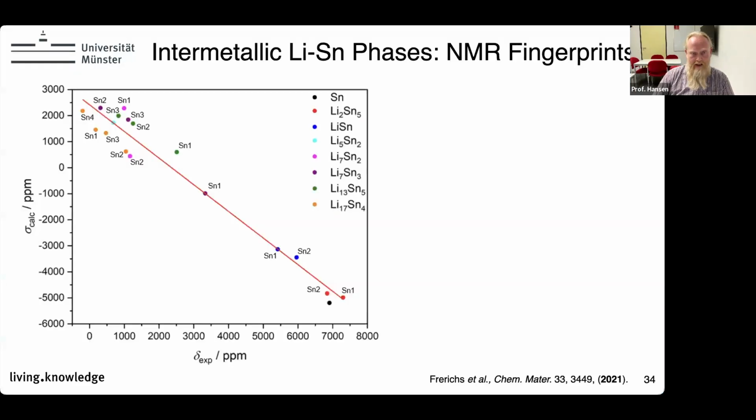So, understanding lithiation of tin phases. And first off, Joop here is the main author of this paper. He synthesized these lithium tin phases here. There's quite a few of them. And then he did NMR, MAS NMR, and also WCPMG NMR.